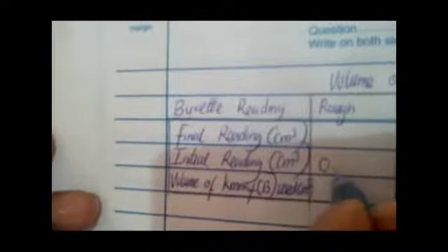After titrating, we write down our values. Remember, we didn't use any indicator, so it's not stated here. We only write down the volume of pipette used, which is 25 centimeter cube. We write down our burette reading, our final reading, initial reading, and the volume of KMnO4 used, which is all written in centimeter cube. Our initial reading is 0.00. Our final reading is 22.00. We find the difference, which is 22.00.